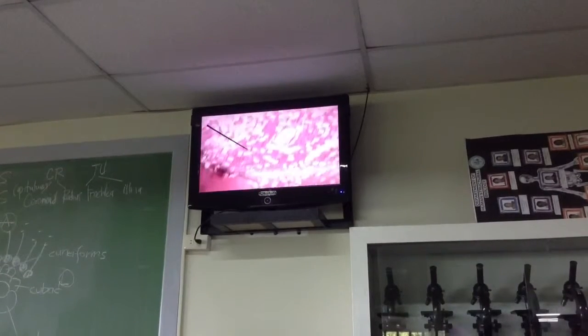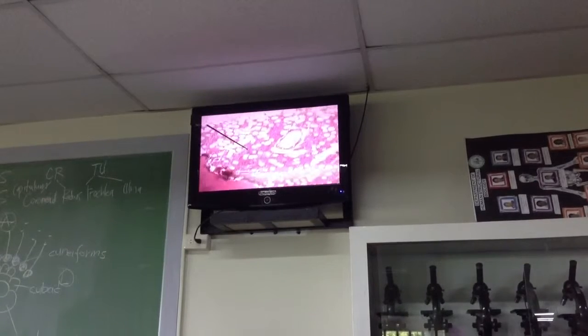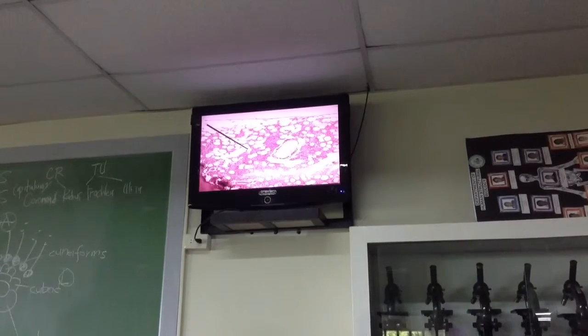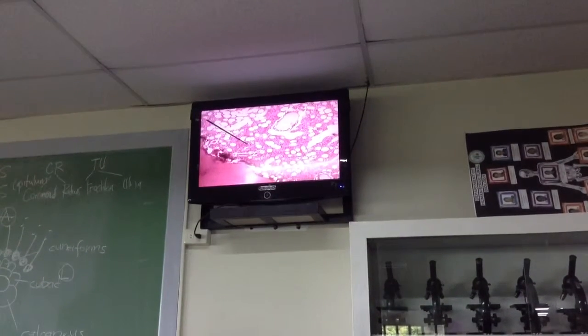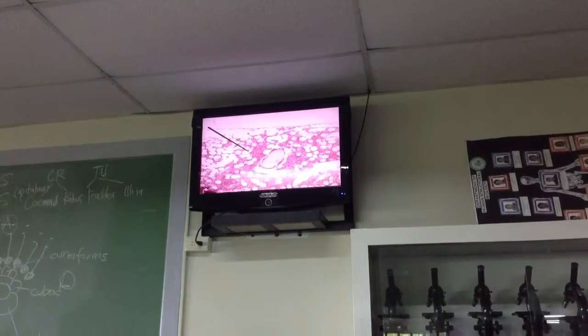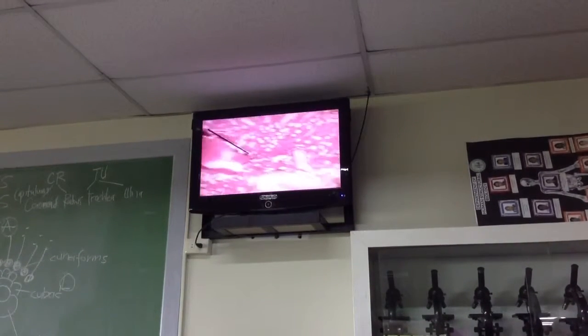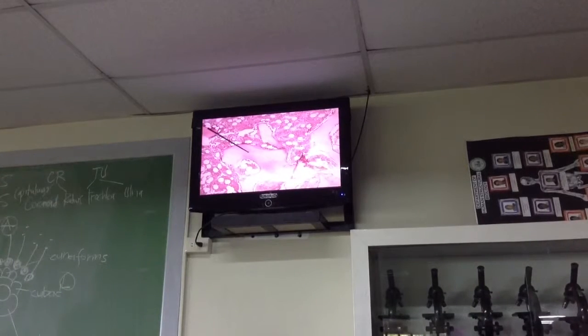This is the bone marrow portion. This contains adipose tissue and some developing blood cells. Hindi po ito ang i-focus nyo. Instead, look for this area, or this area, or this area, or this area.